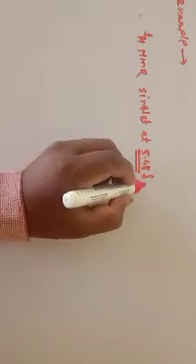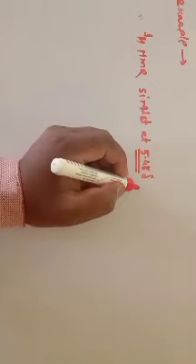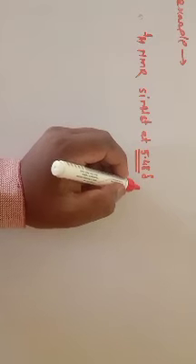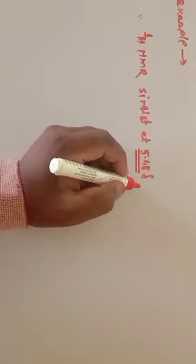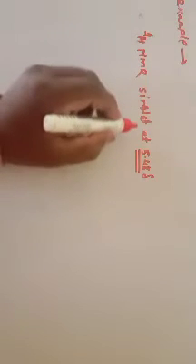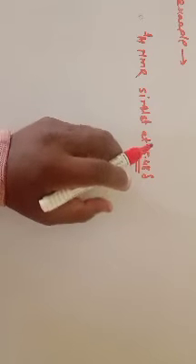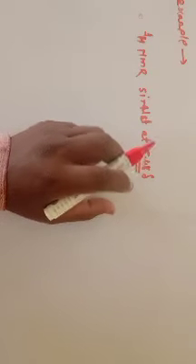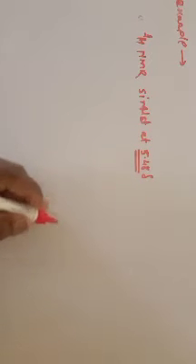What information does it give? It tells us that the eta 5 Cp, that is the C5H5 ligand, the cyclopentadienyl ligand, is retained in the product. So the metal atom molybdenum and the eta 5 Cp ligand attached to it remain as they are in the product.